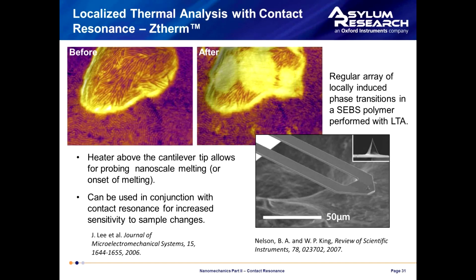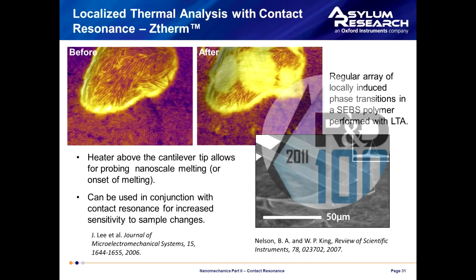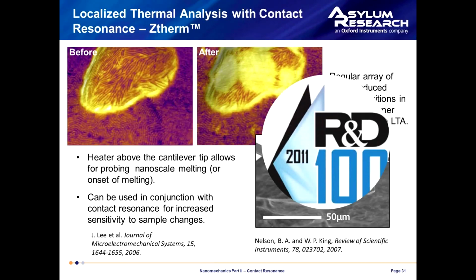What we've done is we've combined this with the high sensitivity of contact resonance to make simultaneous high sensitivity mechanical measurements at higher temperatures, localized higher temperatures. And we were very proud a couple of years ago to win an R&D 100 award for this work.